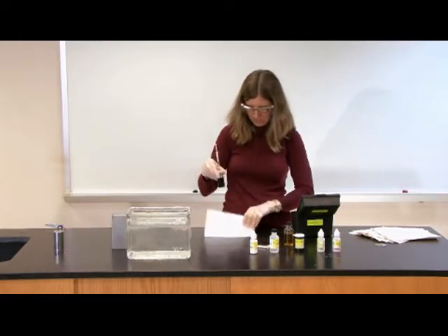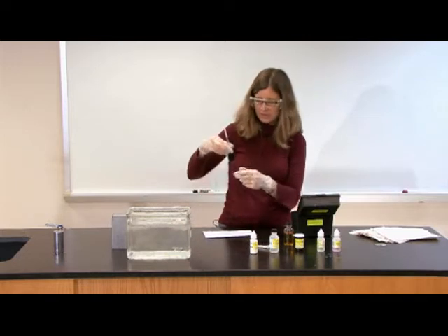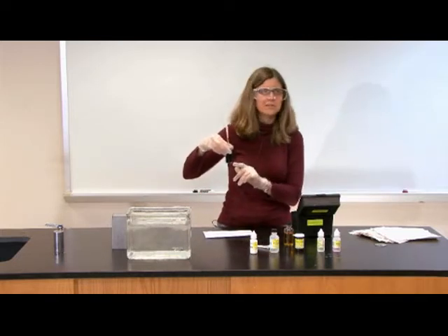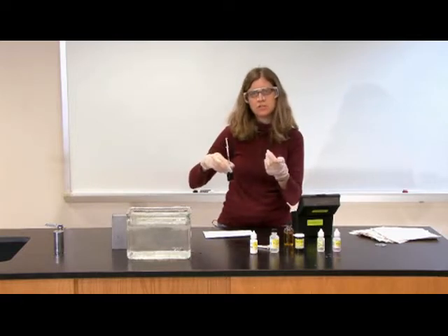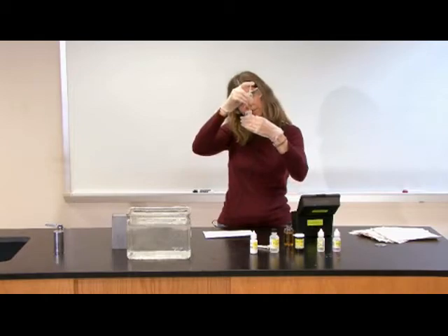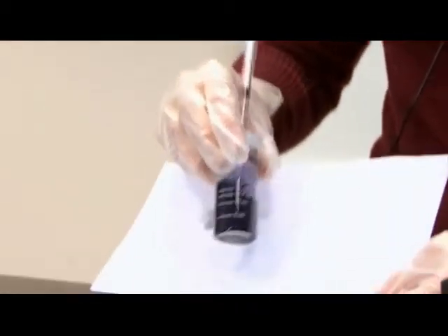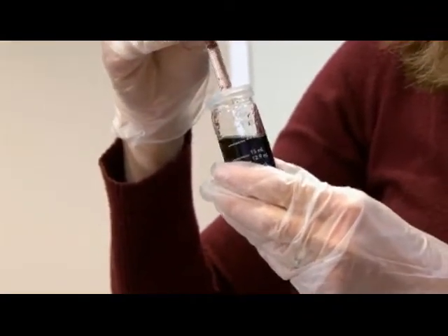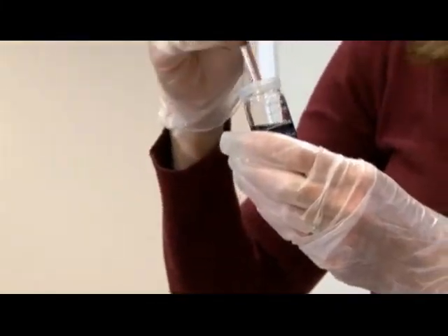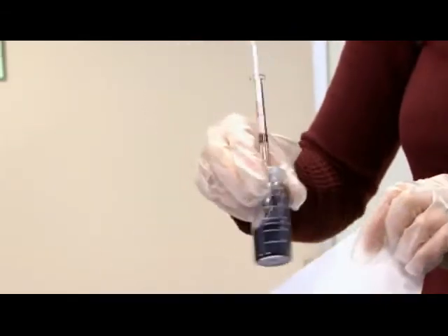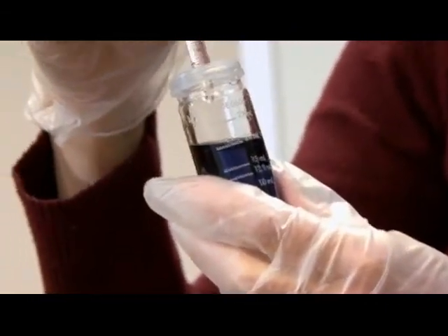What I want to do is I want to titrate my sample one drop at a time, swirling after each addition until the blue color disappears and I have a clear solution. Again, the color change happens very rapidly. So it's important after each drop to swirl and also to compare against a white paper. It looks like it's getting a little lighter, but it's certainly not clear yet.